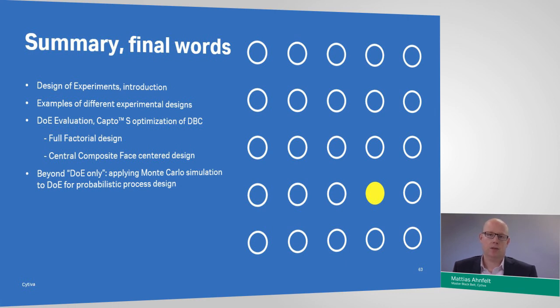We then looked at interpreting the f of x part. Once the error part was okay, we first assessed all the model terms for significance, making sure that whatever we maintain and keep in the model is significant from a statistical point of view.